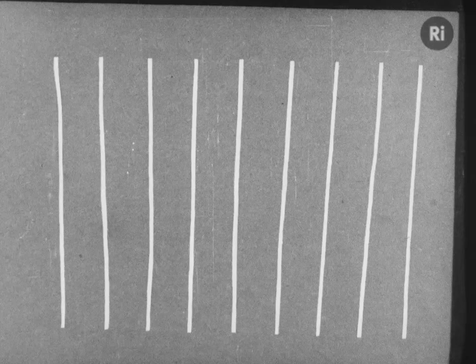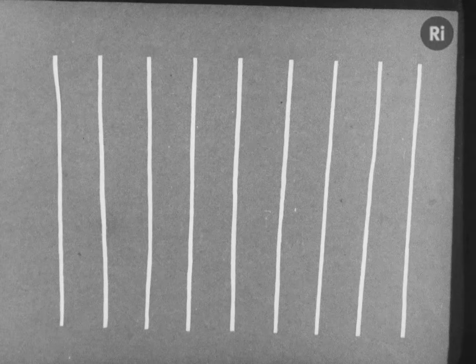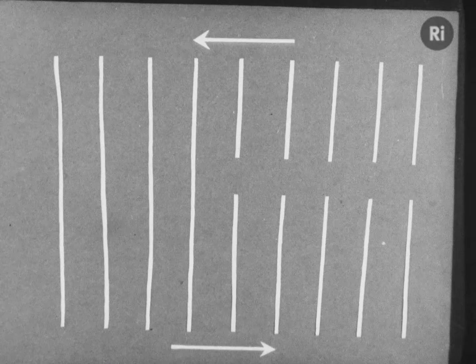A dislocation can be thought of as a place where slip is terminated in mid-air. There's a row above which is not partnered by a row below.